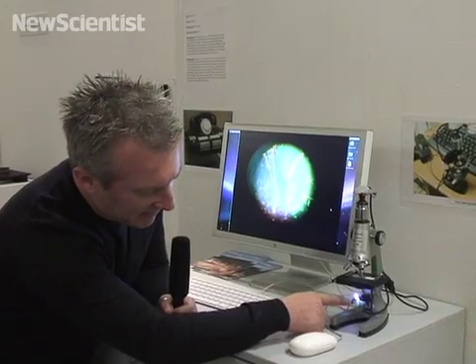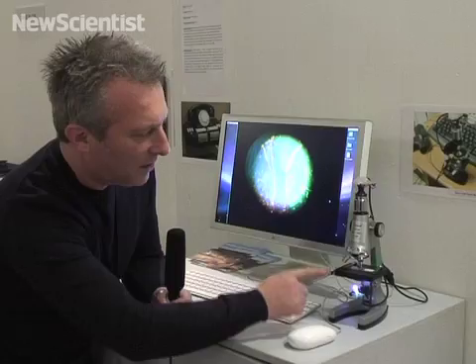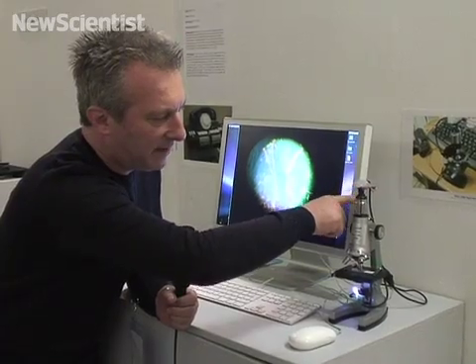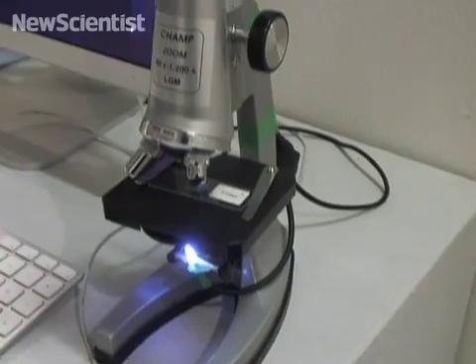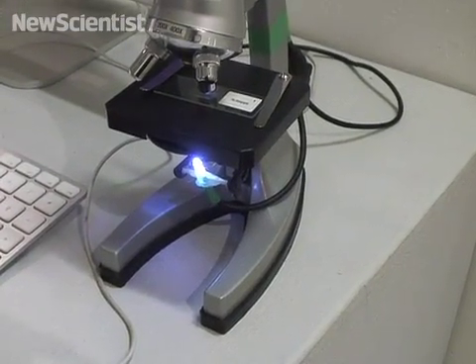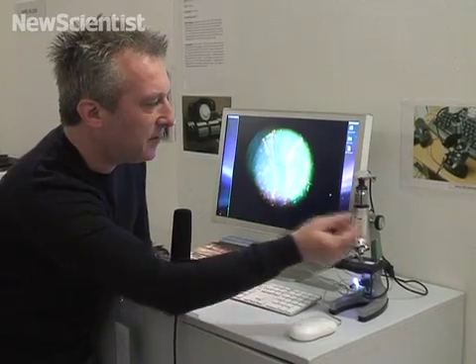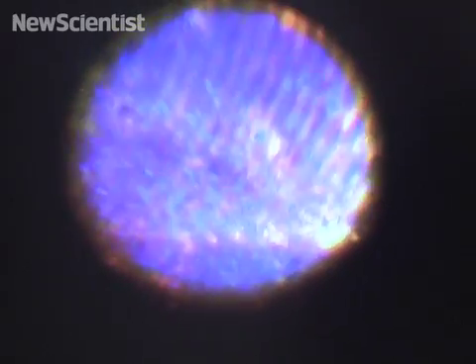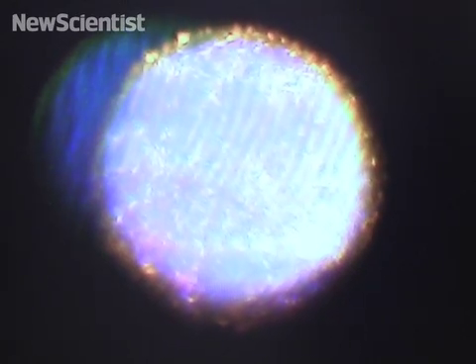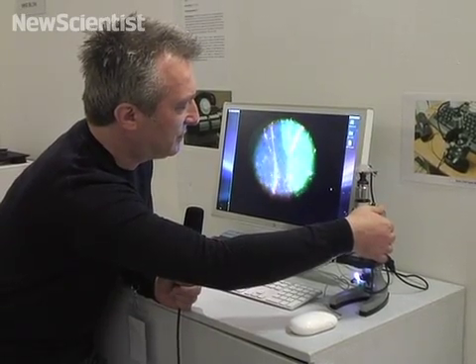An LED has also been added at the bottom to provide light from underneath, all provided from the power line that comes down the USB cable. The USB cable itself plugs into a computer and so you're then able to see the image that comes out from the microscope. You can see that I can adjust and zoom in, and the image that we're seeing changes on screen.